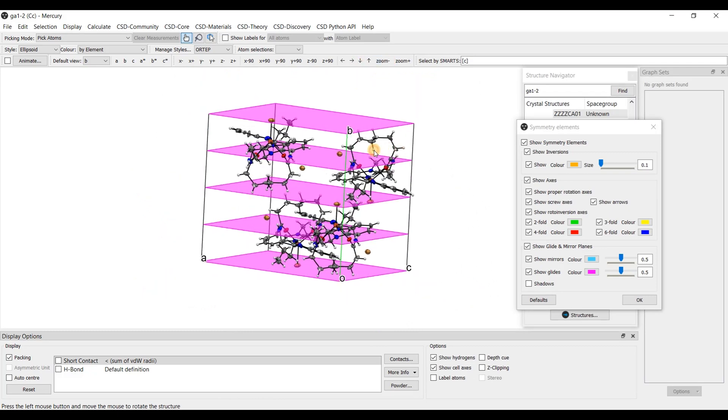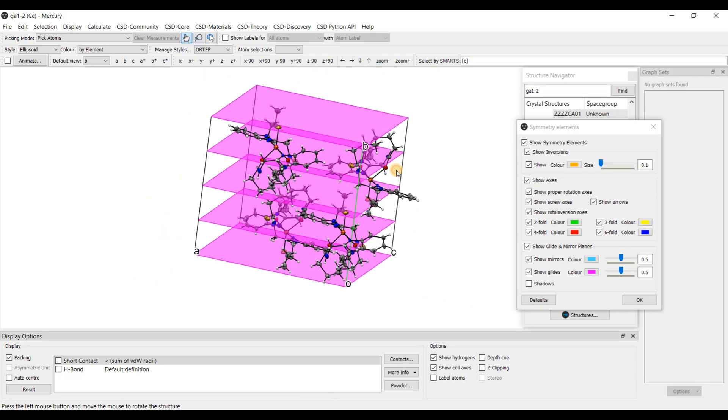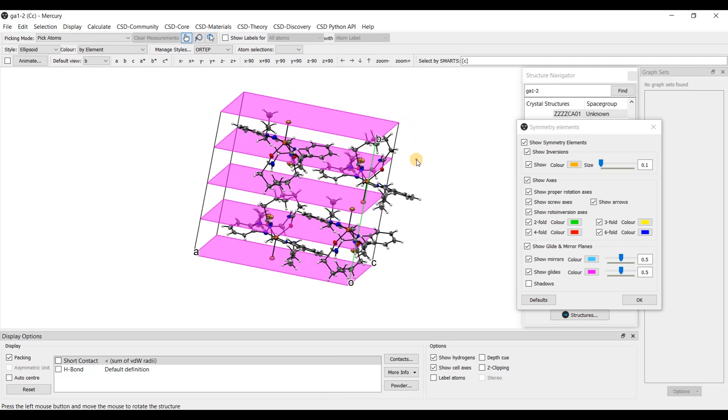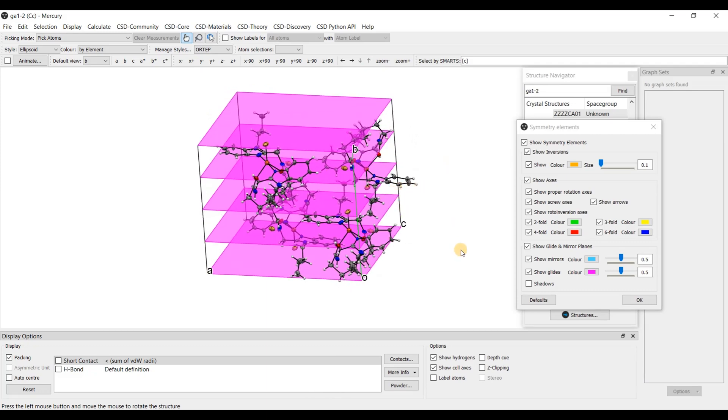And no other symmetry element is present in space group CC. So there is only one symmetry element, the glide plane c.